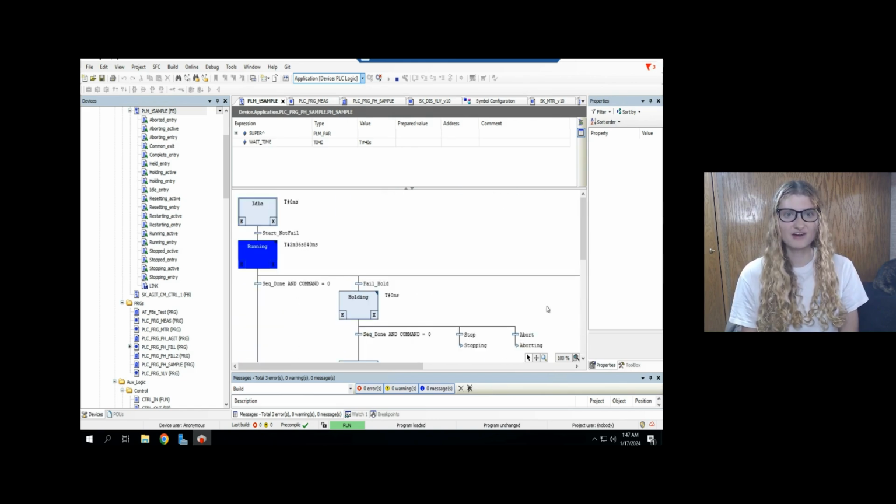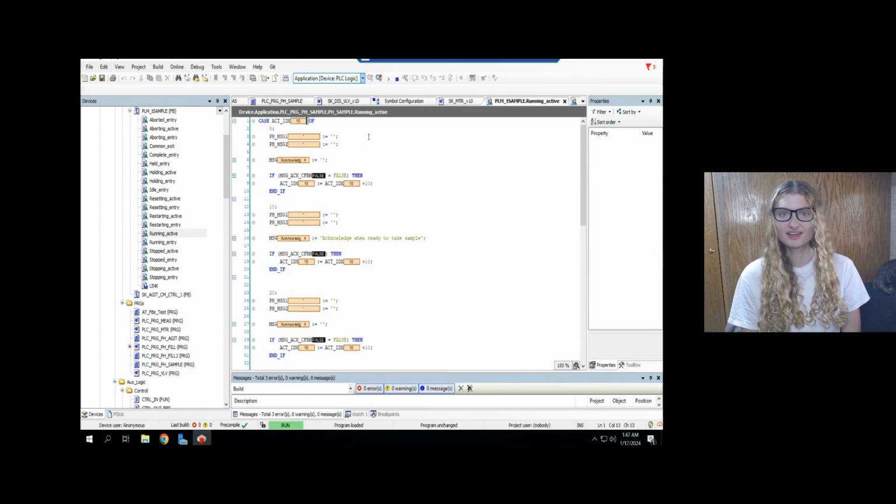I think we even have our phase up and running over here. And if we double click on our run logic, you can see that we actually also have structured text for its functionality. It's also worth mentioning that for version control, you can use Git.